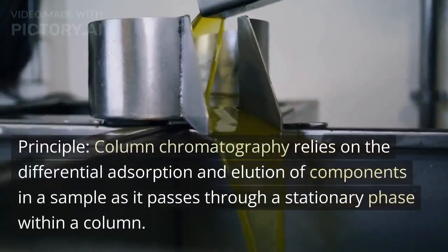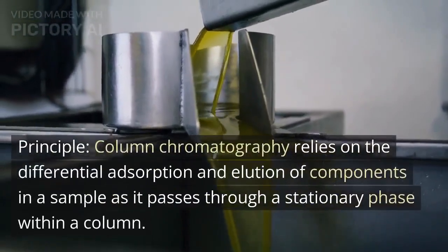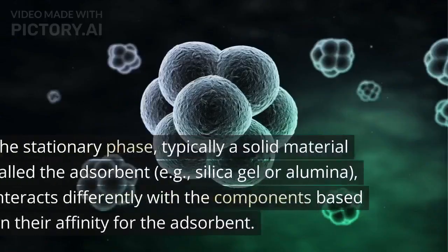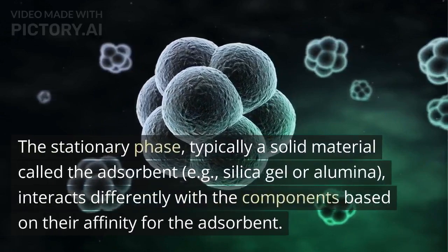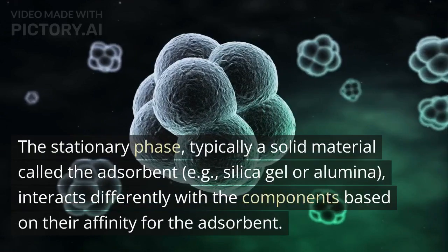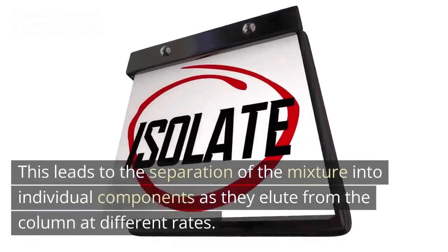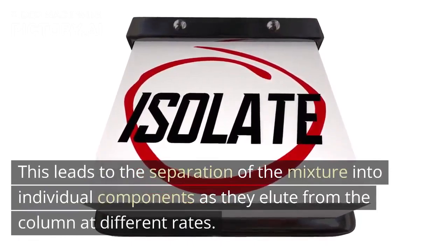Principle. Column chromatography relies on the differential adsorption and elution of components in a sample as it passes through a stationary phase within a column. The stationary phase, typically a solid material called the adsorbent, e.g., silica gel or alumina, interacts differently with the components based on their affinity for the adsorbent. This leads to the separation of the mixture into individual components as they elute from the column at different rates.